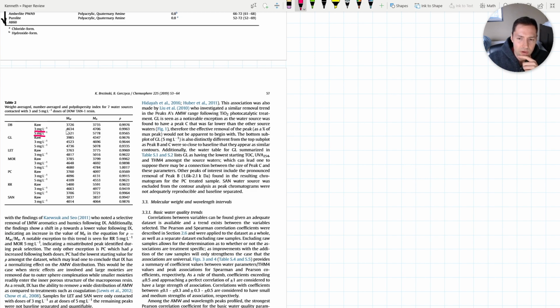And this is important for us because even if we have these distributions, when we're dosing with different concentrations of the resin, what you'll find is that it targets the lower molecular weight of the spectra versus the higher molecular weight. So it's also targeting the size, even though it's only exchanging for the ions, right? And this is important because, again, it's all about characterization. So if we're removing ions, we're removing strong and weak humic substances, and we notice that when we're removing more of those charges, the molecular weight size increases here.